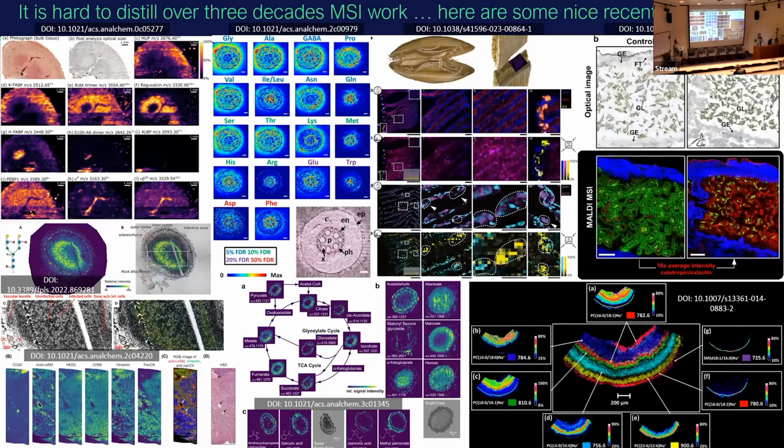And then we can get into the space of going larger from metabolites, not as big as proteins, but we can get into lipid imaging as well, all the way down to roughly that 3 to 10 micron. And we're going to talk a lot about spatial resolution, sensitivity, and a lot of these very large, broad concepts. What we can see is that there's a grand diversity of metabolites, lipids, and proteins all the way throughout very diverse layers.